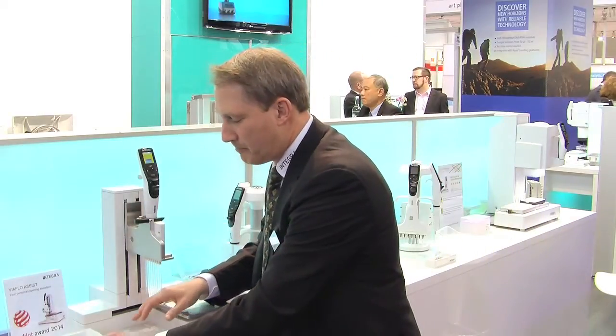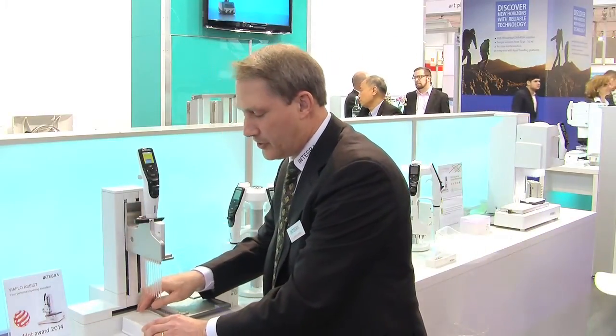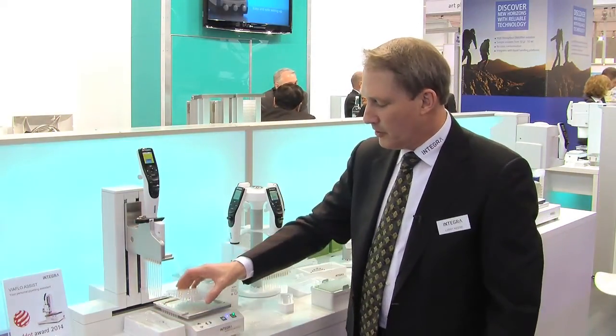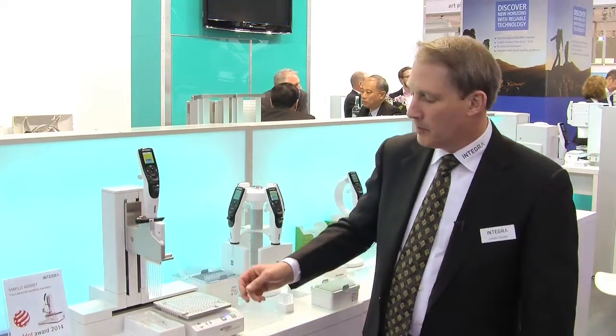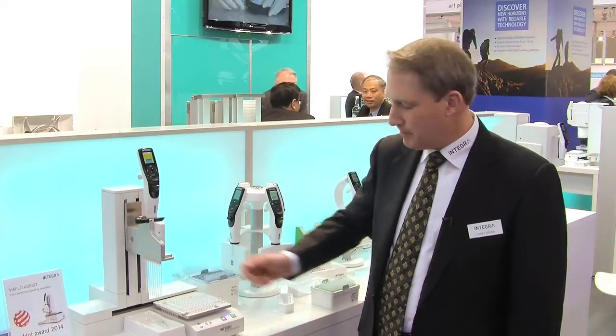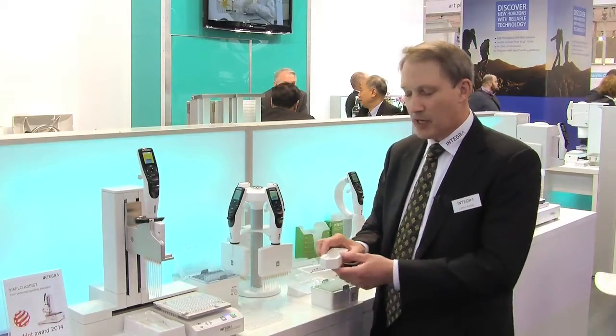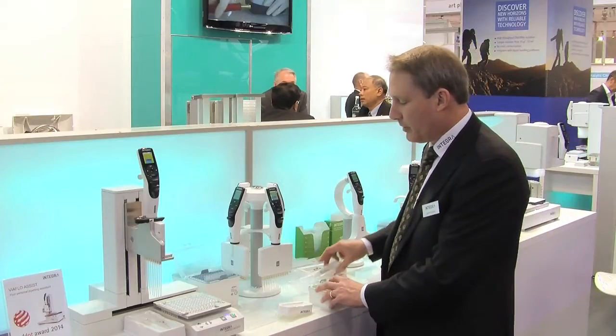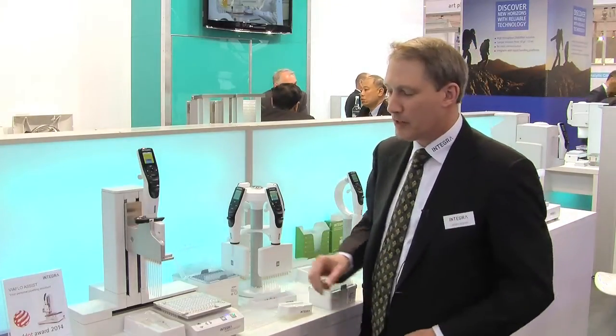You can then go ahead and pick a reagent reservoir that you want to put on the deck. You put on an assay plate that can be put in either a landscape or portrait format, and you have the choice of the kind of reservoirs you might want to use — a 10 ml, a 25 ml, or 100 ml, as I just put on the unit.